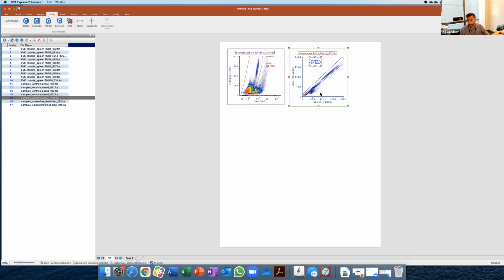We wish we could have everything as singlets. That's the objective, to have as much as possible a good single cell suspension. We don't have that control, so we have to base ourselves on the knowledge of the voltage pulses, etc. We won't go into details here, but essentially you want to use this gate and follow the diagonal in which the populations are going, right? The distribution. And that's basically the criteria.